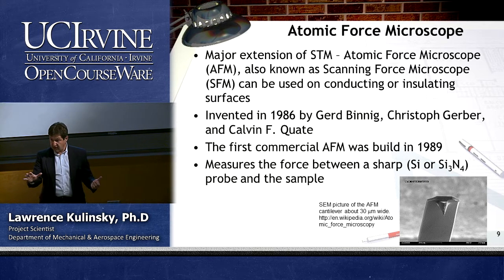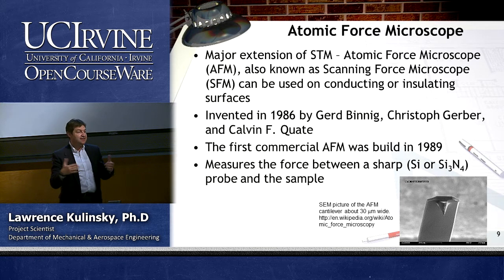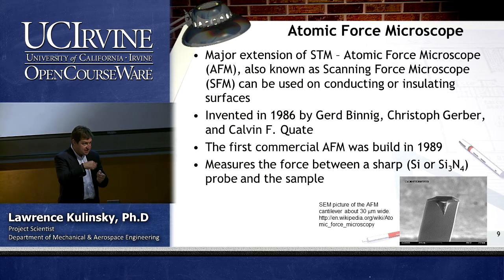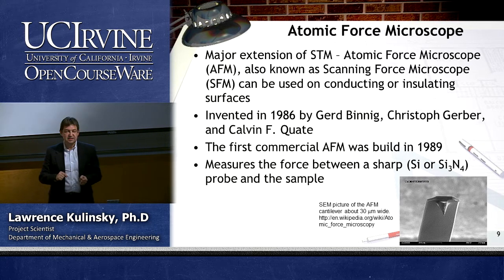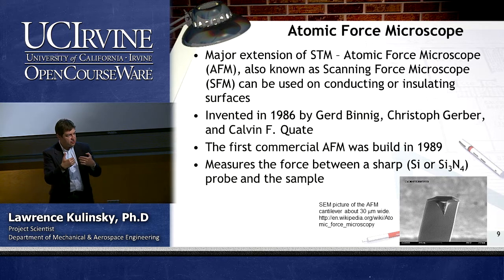Typically what happens, you have a very sharp tip, you have a surface. So you actually have a monolayer of fluid, typically, condensed on your surfaces. So what the tip measures, and people are actually kind of confused about what forces are there. They first thought it's van der Waals forces. Van der Waals is kind of polarization forces.